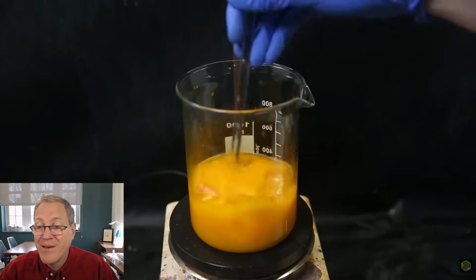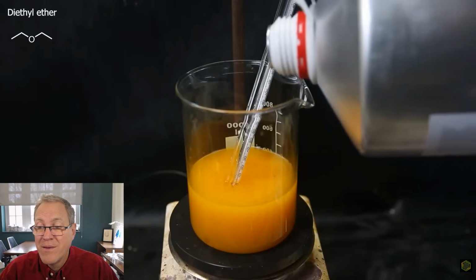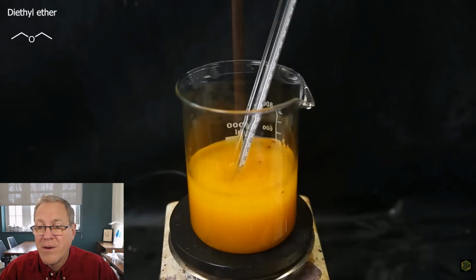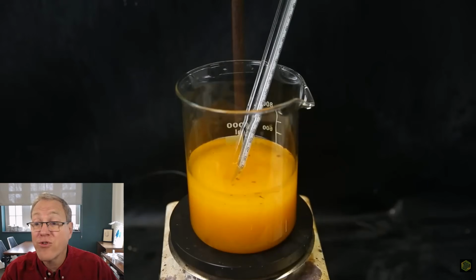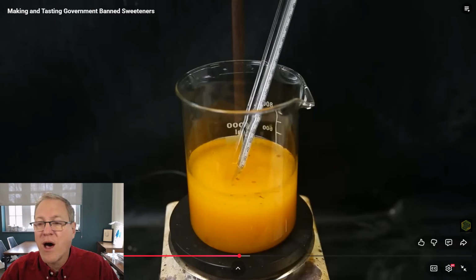I allow it to cool down and wash out the flask with some water. When it's cold enough, I add a random amount of the solvent diethyl ether, which will dissolve the precipitated product. Okay, so you saw how cloudy it was when he had it in water. That's because the product really is not very soluble in water. So he throws in a solvent that will dissolve the product, a diethyl ether. And so now he's going to have a two-layer system, ether floating on top, the aqueous layer on the bottom. And his product should want to dissolve into the ether layer on top.